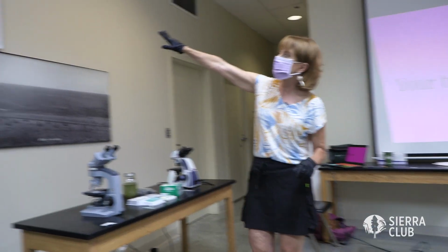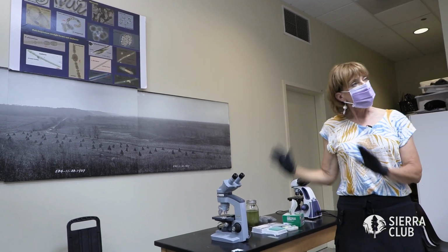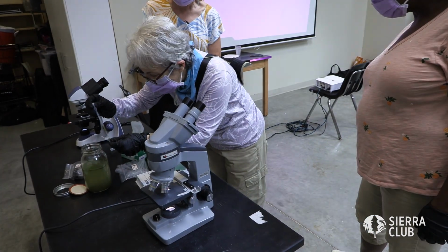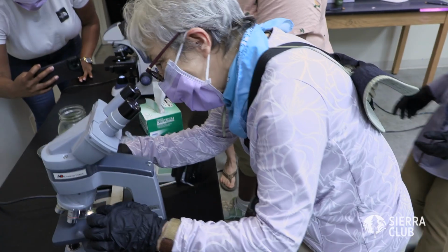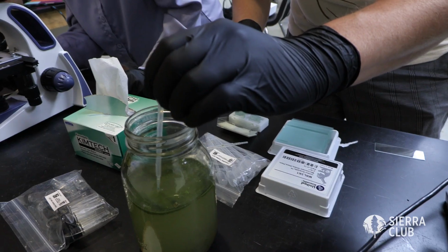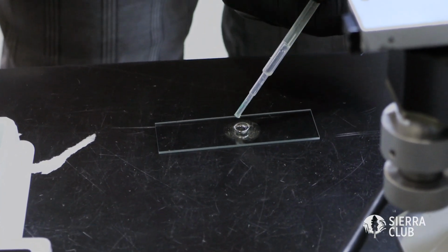Here's a fun poster. These are things you are likely to find under the scope. If you find something in your sample, don't shout it out. Let other people have the experience of discovering. And here we go. You want a slide. I'm going to use a pipette. You're going to take a drop from the top of the sample where the cyanos reside.